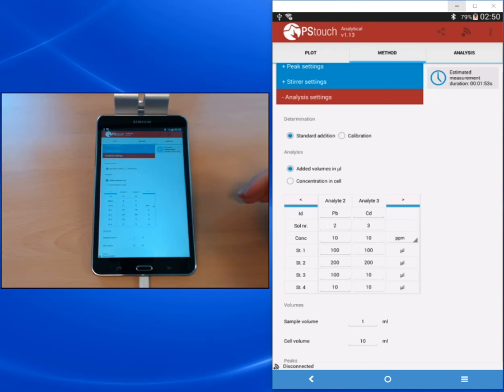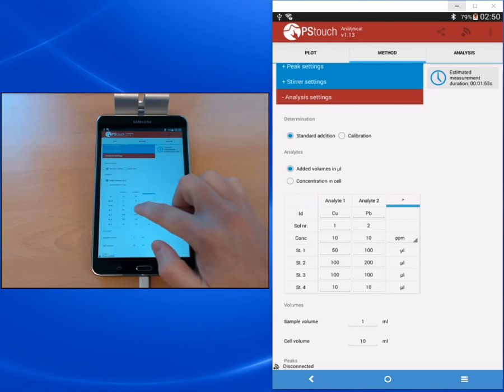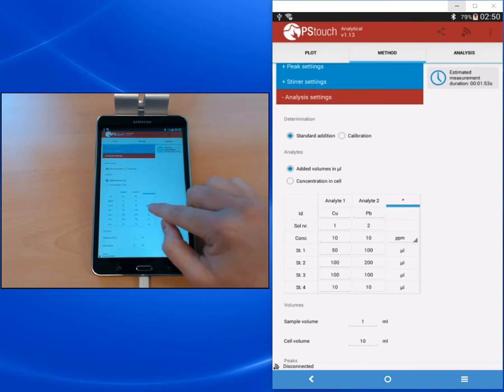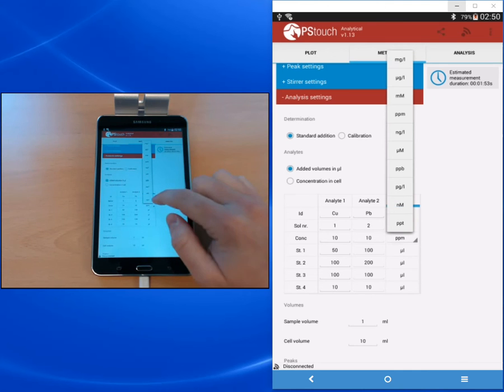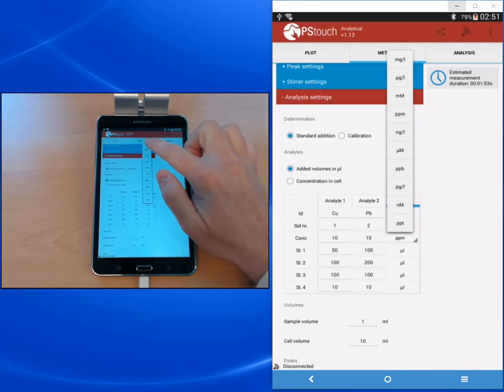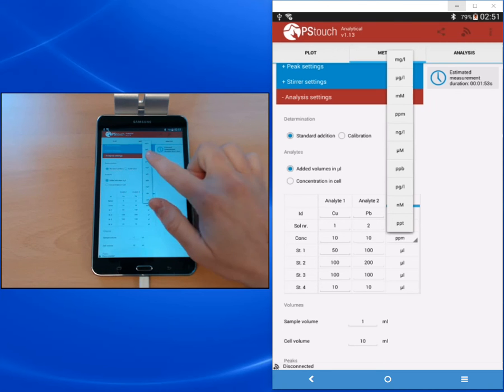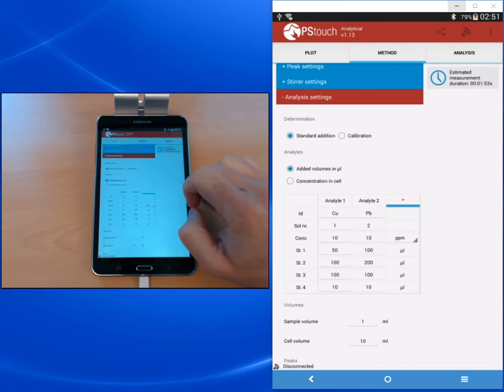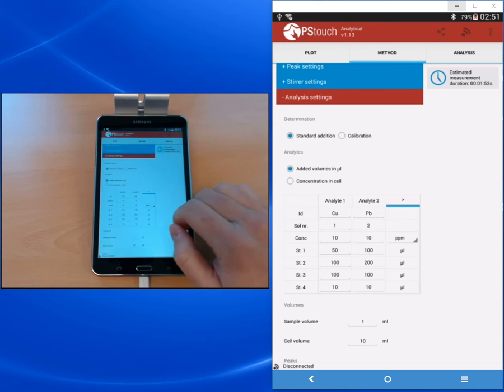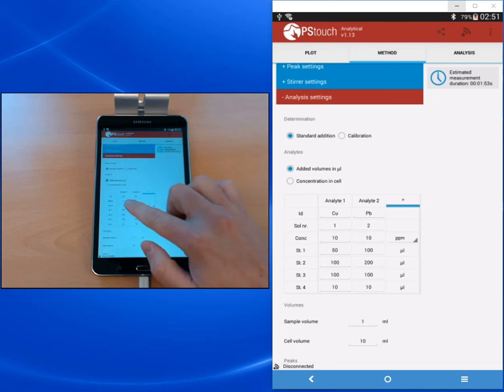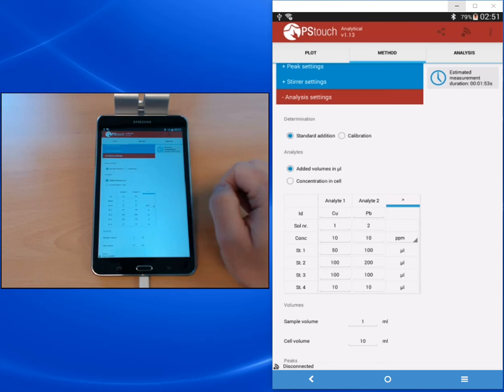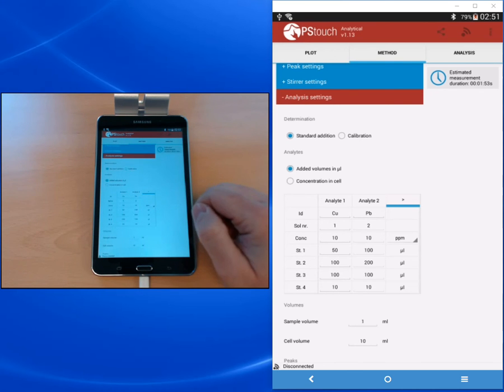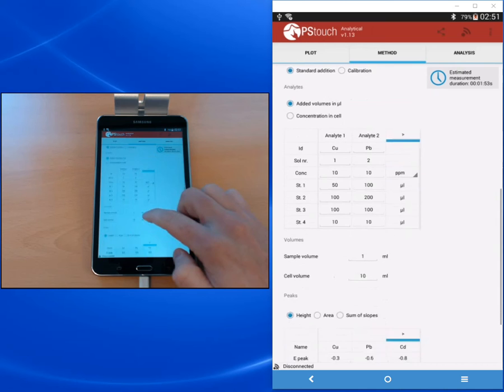The next row is about concentration. There you enter the concentration of your standard solution. At the end of the row you find a drop down menu where you can choose which concentration unit you want to use. Examples are milligram per liter, ppm, or nanomolar. This will also be the units for the results. The lower part of this table indicates the volume in microliters that was added after each measurement.